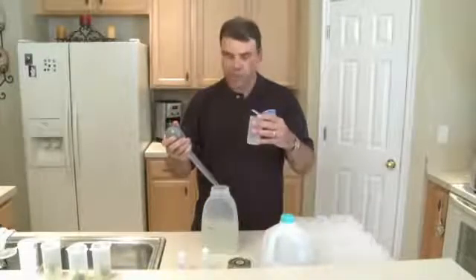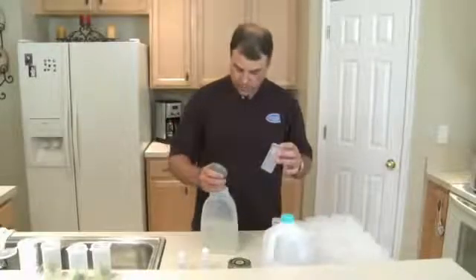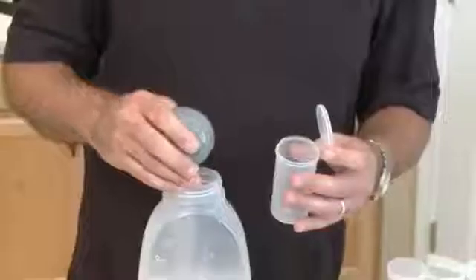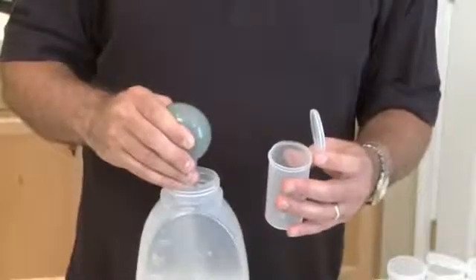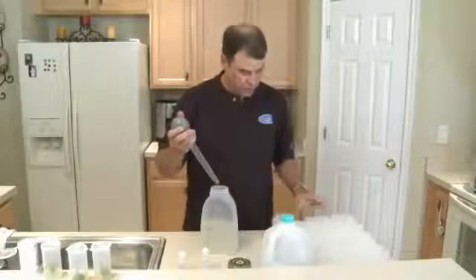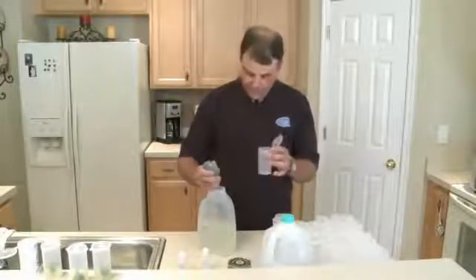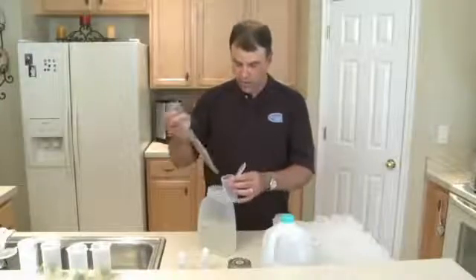That's all we're really trying to do, and we need to do that fifty times. Draw it up, pump it down to stir it, and quit right at the twenty mark. You can see that twenty milliliters is going to be the same in all these containers — up, down, hold it at twenty.